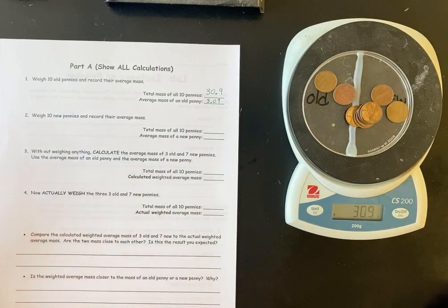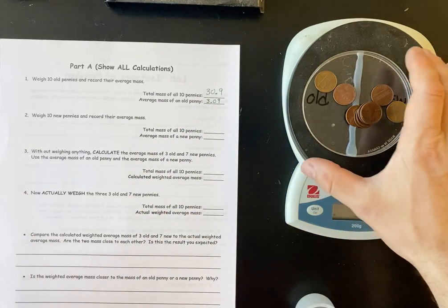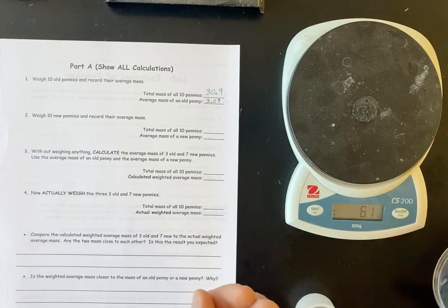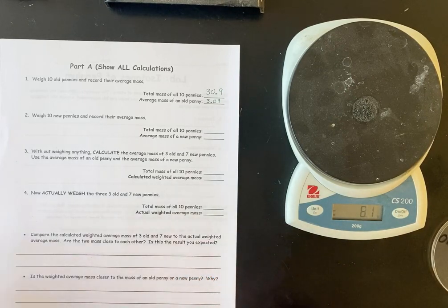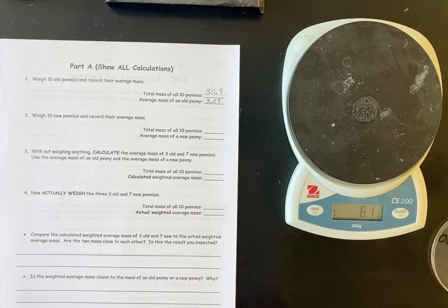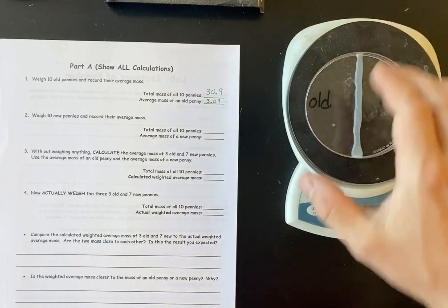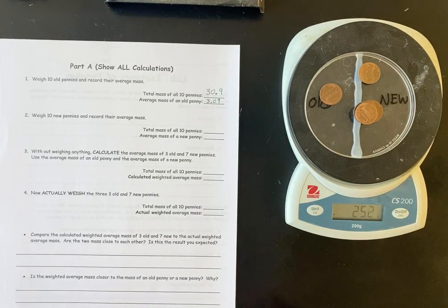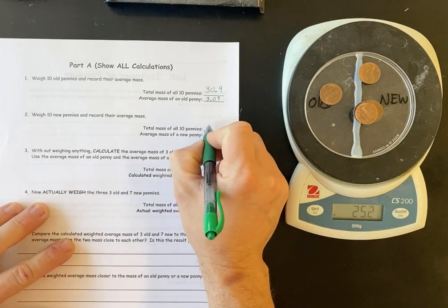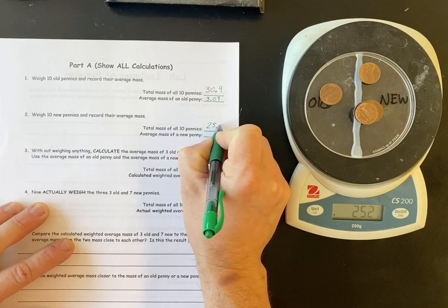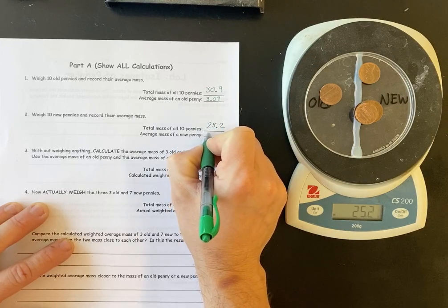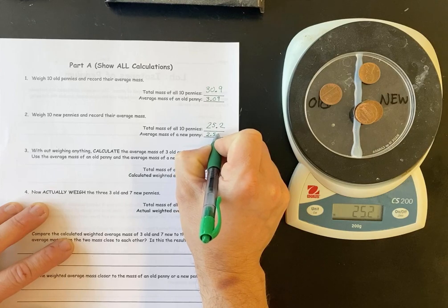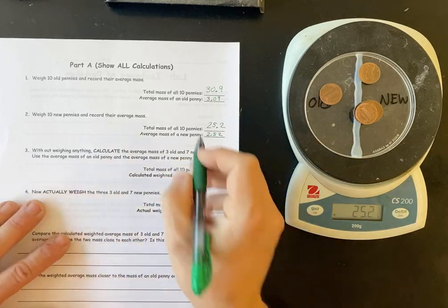All right. Then we put them back. Now, the next thing you're going to do is you're going to do the same thing, but with 10 new. So it's zeroed out already. I counted already that there were 10. We weigh our 10 new, and we get 25.2. Divide that by 10, 2.52. So, and then these are grams.